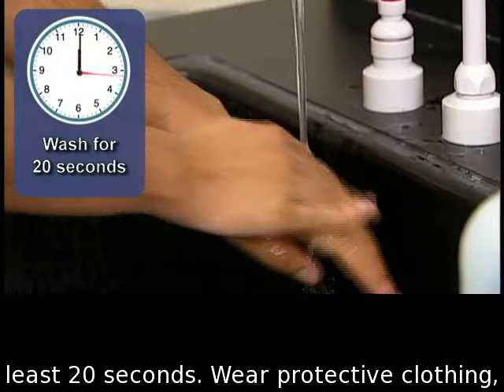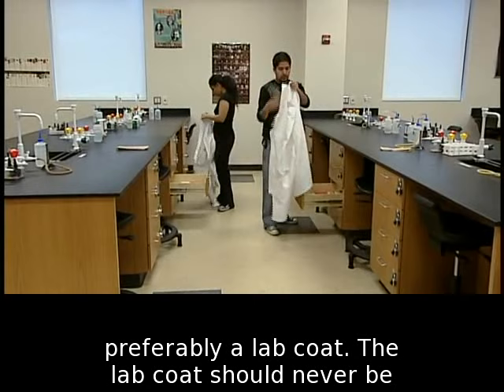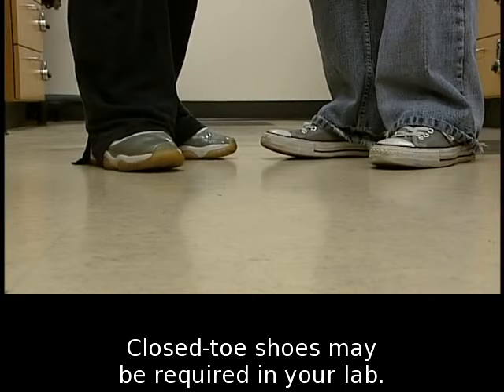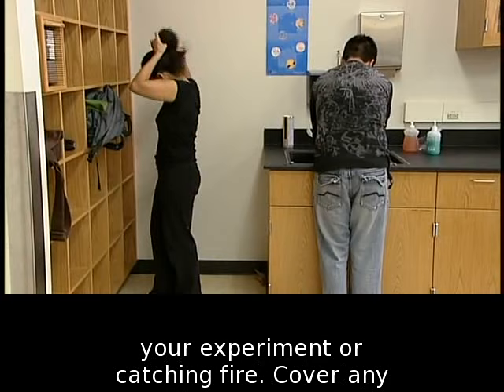Wear protective clothing, preferably a lab coat. The lab coat should never be worn outside of the lab. Always wear shoes — closed-toe shoes may be required in your lab. Tie long hair back to prevent it from contaminating your experiment or catching fire.